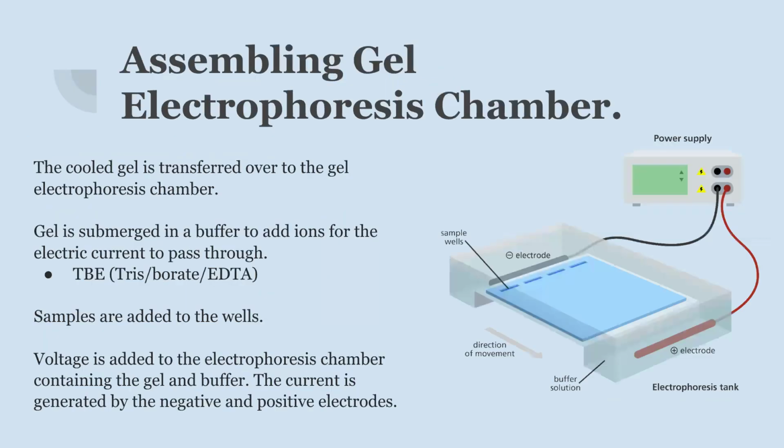So now the cooled gel is transferred again over to that electrophoresis chamber. The gel is submerged in a buffer to add ions for the electric current to pass through.